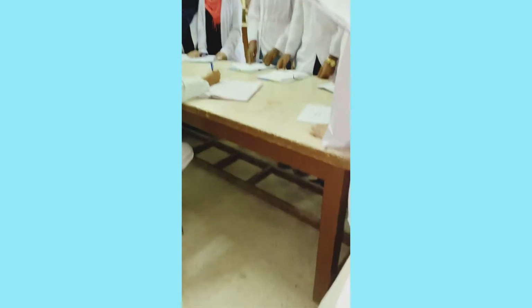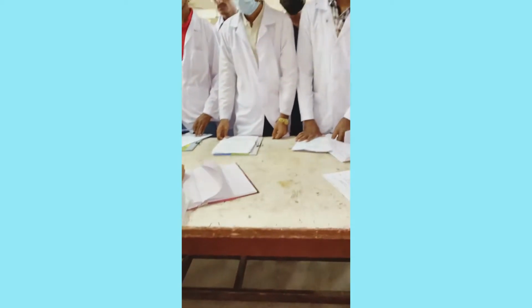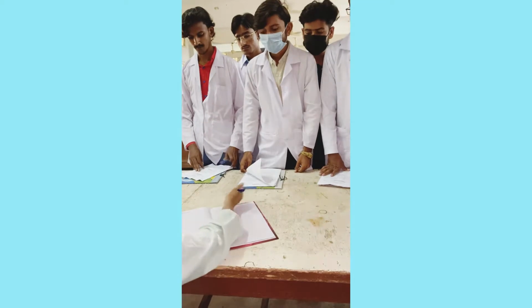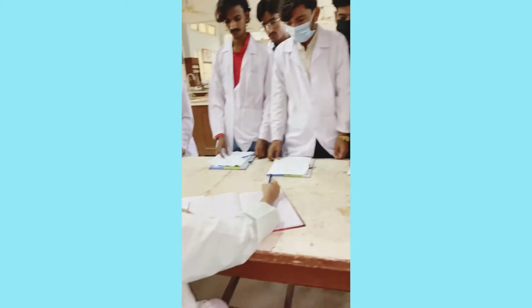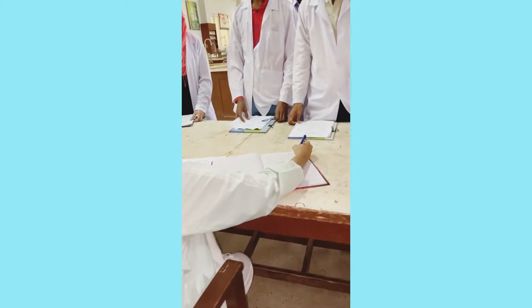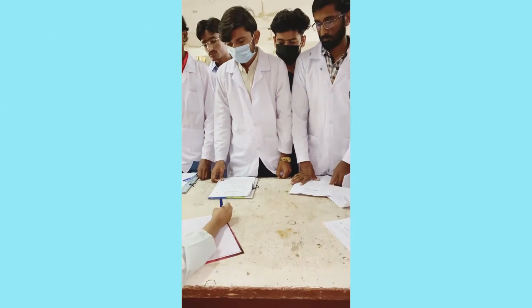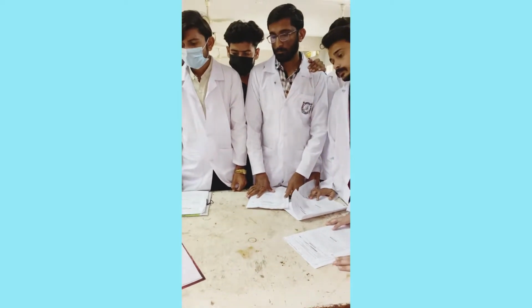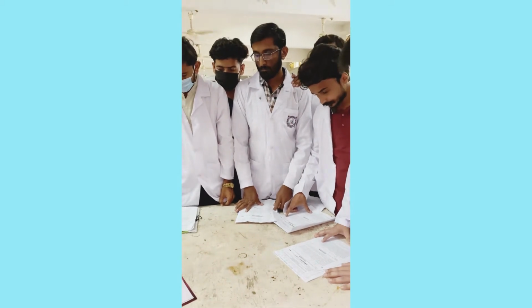So now in the journal, you are going to write down experiment number 1. Please follow the format I am applying here. On the right side of your journal, you are going to write down experiment number 1, and mention the date, 20/09/2022. You're going to write down the object, which is to synthesize or prepare.